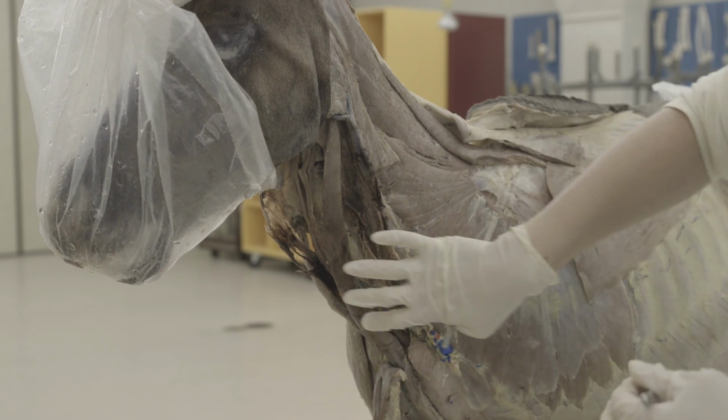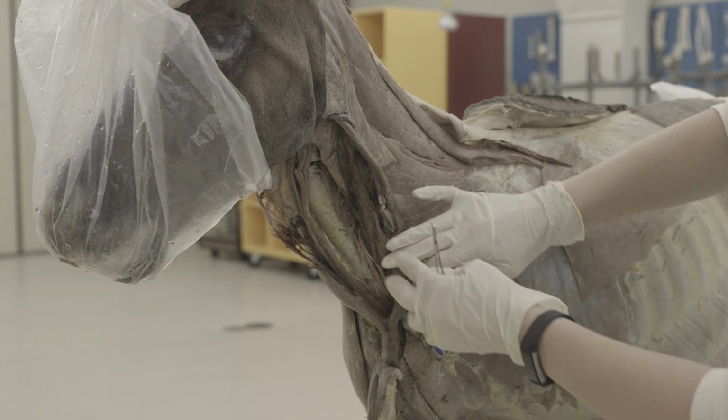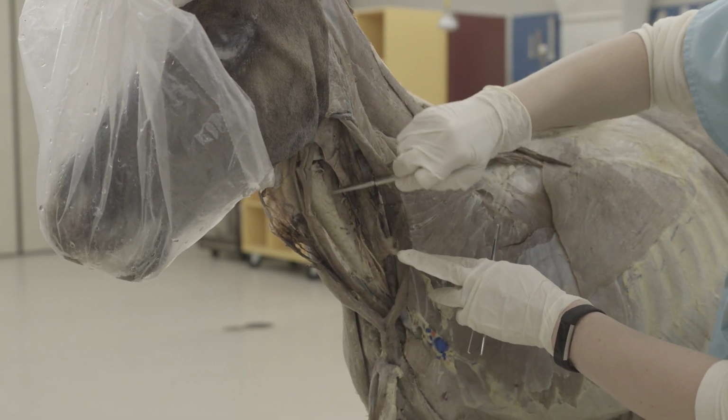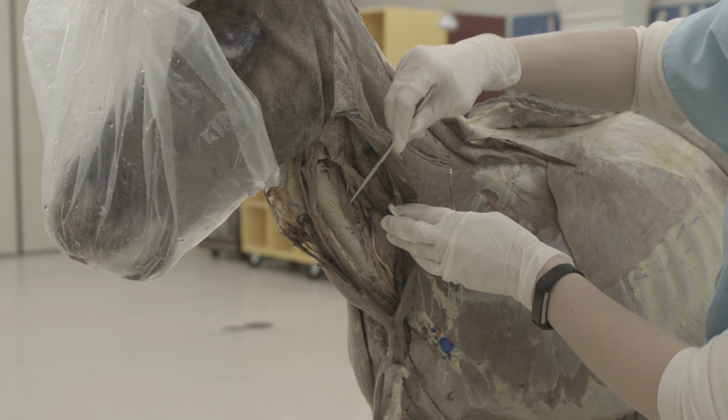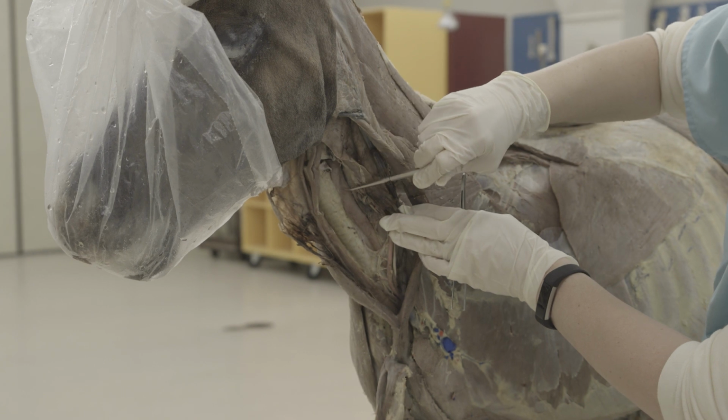Then also here you can see the trachea. So once you dissect out your sternomandibularis and pull that over to the side, you can see the trachea here. And then you need to dissect your esophagus as well. So the esophagus is right next to the trachea, right here.